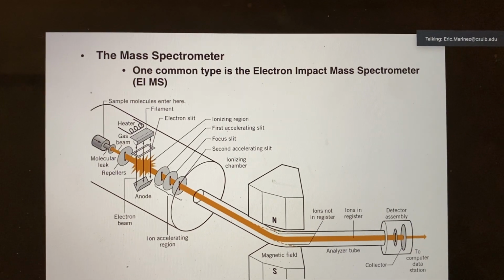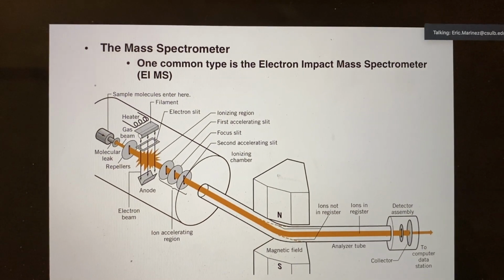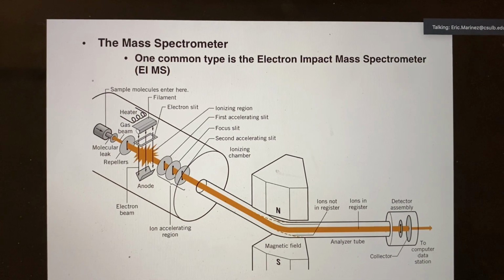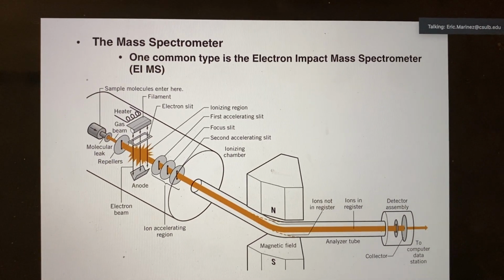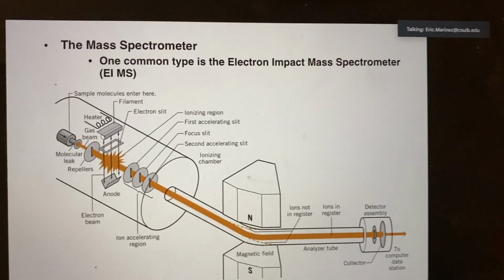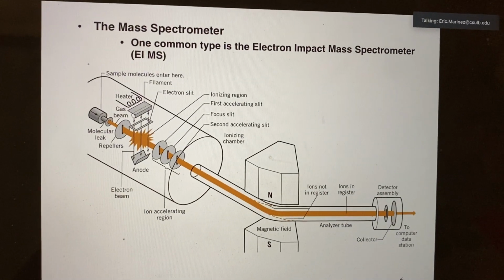So we basically want a system where two molecules that form radicals can't react with each other, because they would dimerize and I can't determine the molecular weight. So first we convert the molecule to the gas phase, and we're going to use very low pressure to minimize the concentration of molecules reacting with each other.